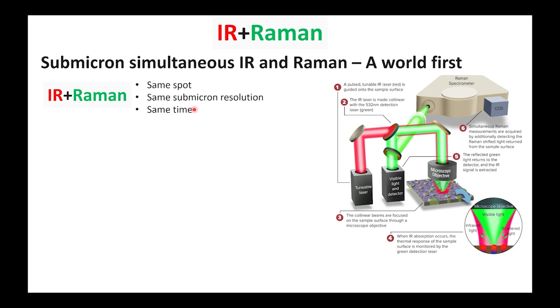Now let me just take you through this very simplified schematic here. That infrared laser, the quantum cascade laser, the QCL, is shone through our microscope objective, focused down not so tightly because you can't. At the same time, we bring in our probe beam, as I just mentioned before. Now that is focused much more tightly. That's where that photothermal magic happens. The reflected green light is then sent back to a visible detector, and I'm stressing the word visible because it's room temperature.